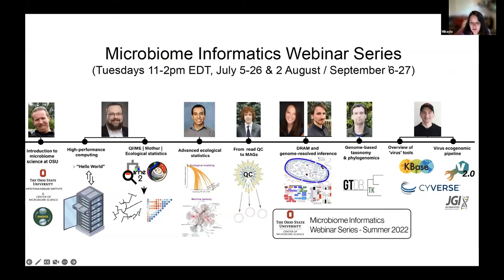Okay, so here's where we are in the lineup of the microbiome informatics webinar. So we're right here, this is Rory and I. And so last week you heard from Dylan, or I guess it was last time because we took a little break, about QC from reads to MAGs. And so today we're going to talk to you about how you might be able to annotate those MAGs and what those functions would be from that last step.